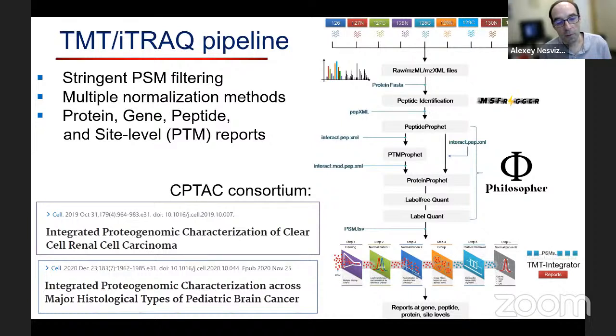So I welcome you to look at this. Google Kerry Bacchus and you'll find it's a chemical proteomics application, MCP from a few months ago, a benchmarking against Skyline. So exactly like you were saying, a lot of manual processing, as well as a lot of manual analysis, a lot of benchmarks with 4-to-1 labeling and 2-to-1 labeling, 1-to-1 labeling, and so on and so forth.